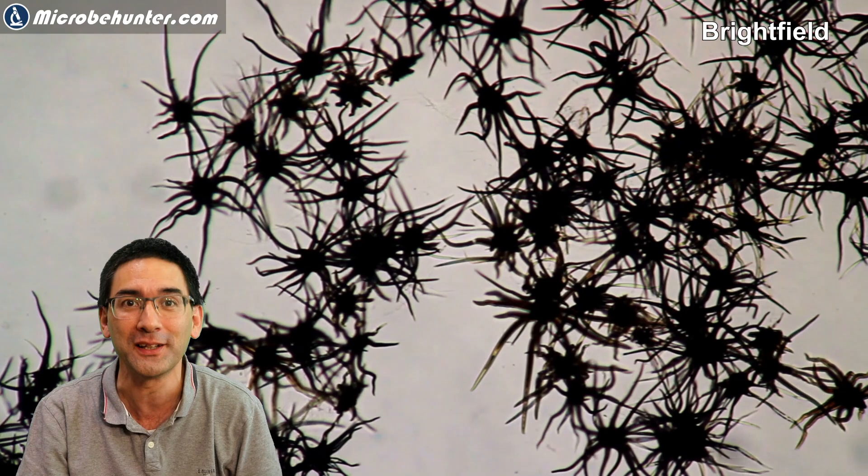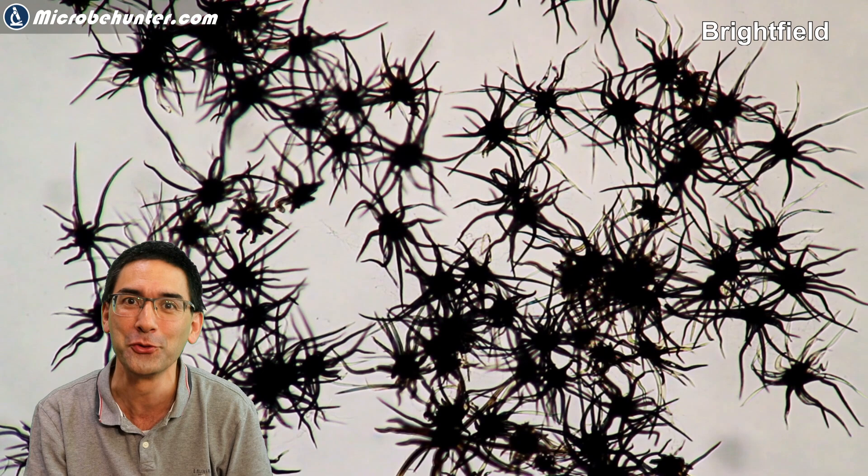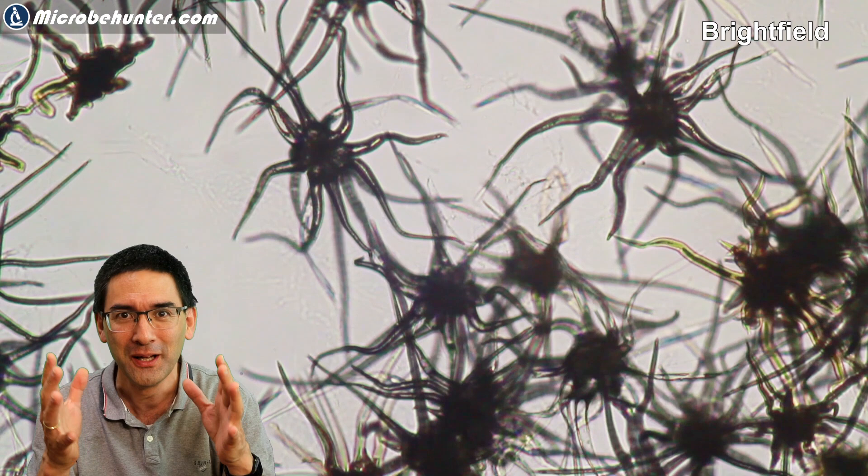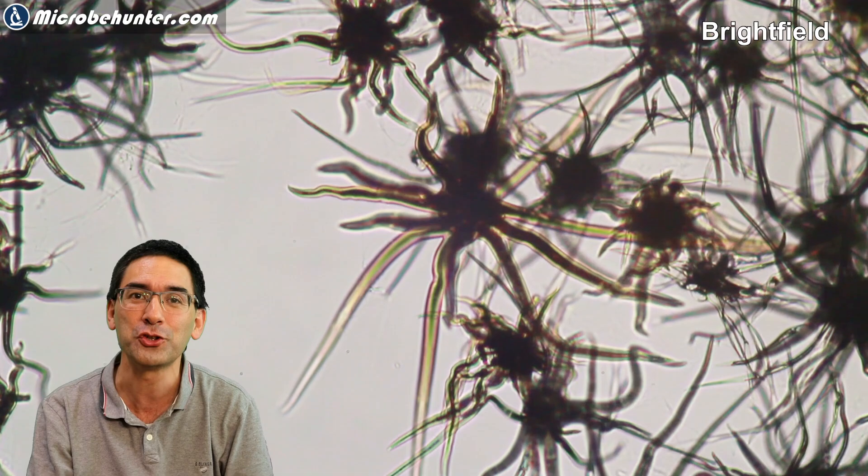Hello and welcome again, Microbe Hunter here. Today I'm going to talk about those trichomes, and somewhere in the corner you should also have a little text describing the method I used to take these images. For example, this one here is taken in regular conventional brightfield microscopy.